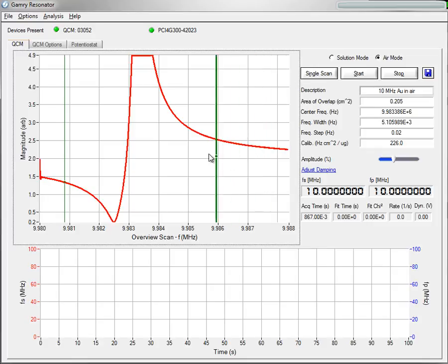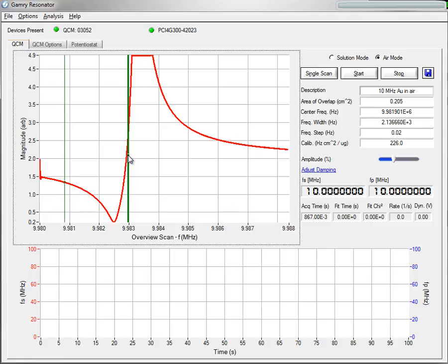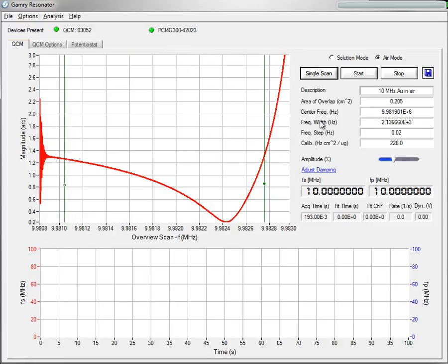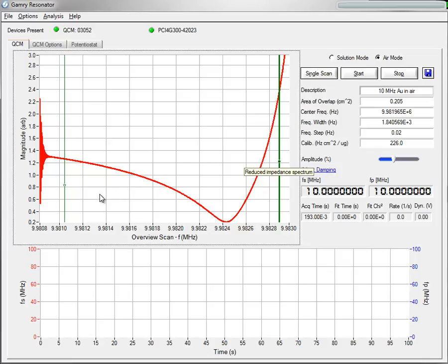So, in Air Mode, what you're going to do is take the right cursor and come close to the center frequency. Essentially, we're defining a window that we only want to scan through roughly half the spectrum. So, I set that there.